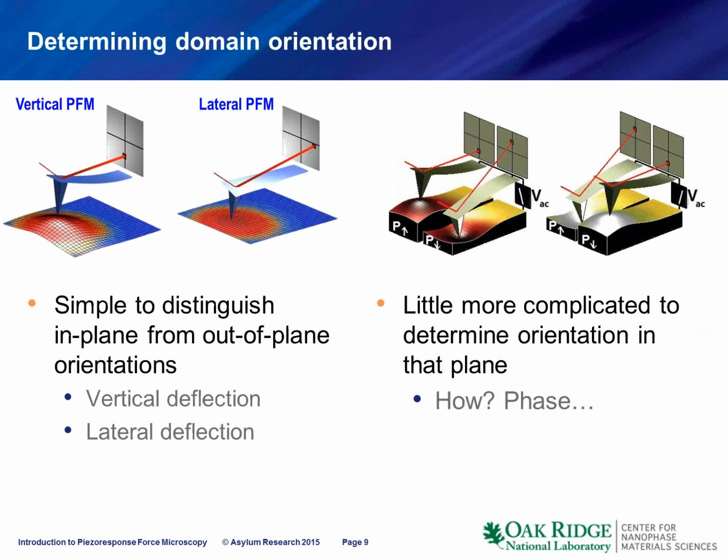So how can we expand this principle? We will use the properties of the SPM. For example, we can measure the vertical surface displacement, what we call vertical PFM, via the flexural oscillations of the cantilever, but we can also measure the lateral displacement of the surface by the torsional oscillations of the cantilever. And you can see how the photodiode of the modern AFM allows us to distinguish vertical and in-plane components.